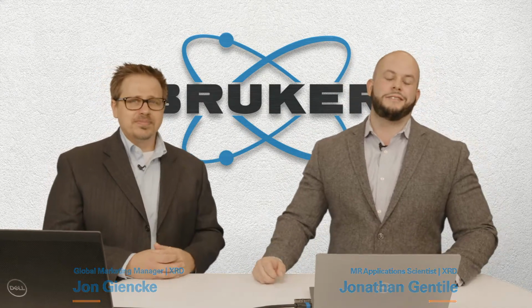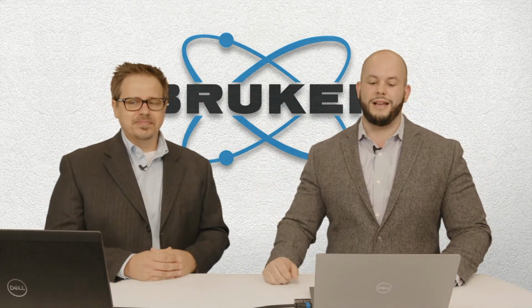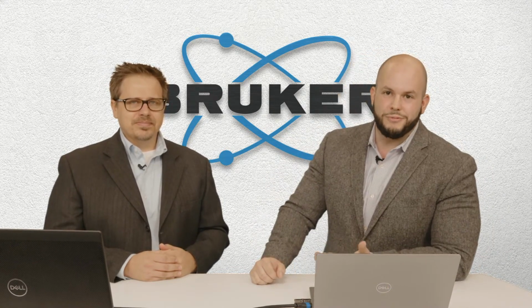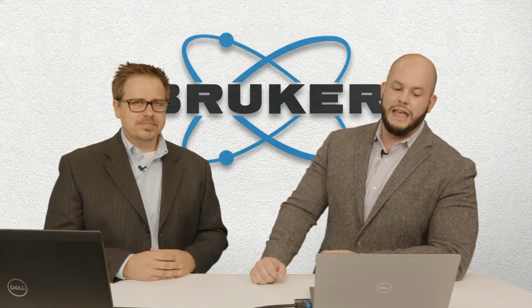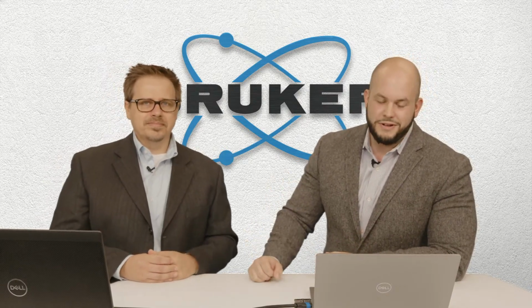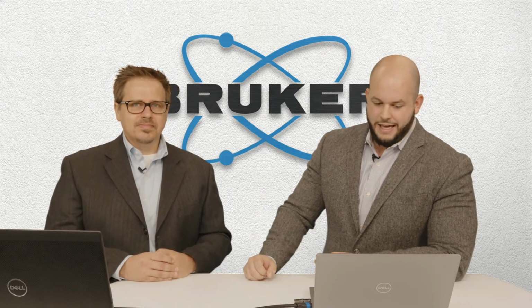That's right. So preferred orientation analysis is becoming more prevalent as we try to push the boundaries for performance and materials applications for engineered structural materials and things like the turbine blades and the engines that you're talking about. So it's important that we come up with a systematic method to understand texture in materials, and Bruker has been one of the leaders in developing that.